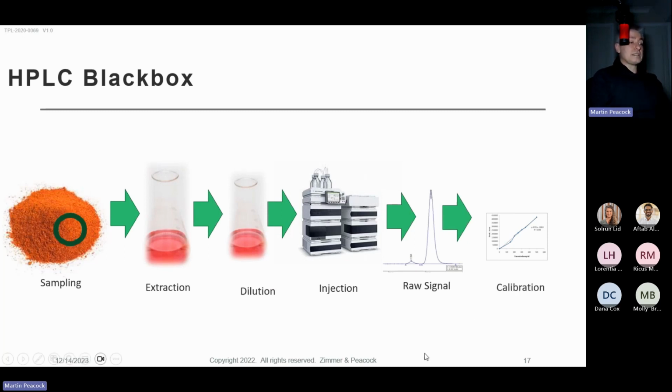Now, all that said, the HPLC is obviously expensive. It's not transparent. You don't see what's happening, whereas you will see today that we'll do the entire process in front of you, so that if you're the one doing it, or your technicians in your building are doing it, then you can have trust in that data.